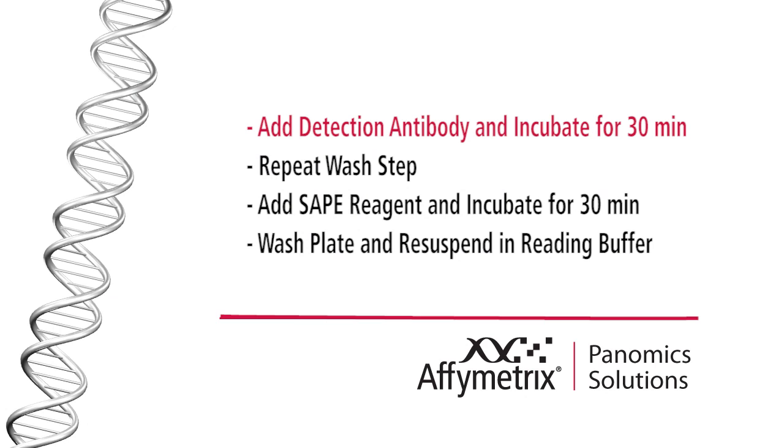Add the biotinylated detection antibody to each well and incubate for 30 minutes. Repeat the wash step as previously described. Add the SAPE detection reagent and incubate for 30 minutes. Repeat the wash step and re-suspend beads in reading buffer.